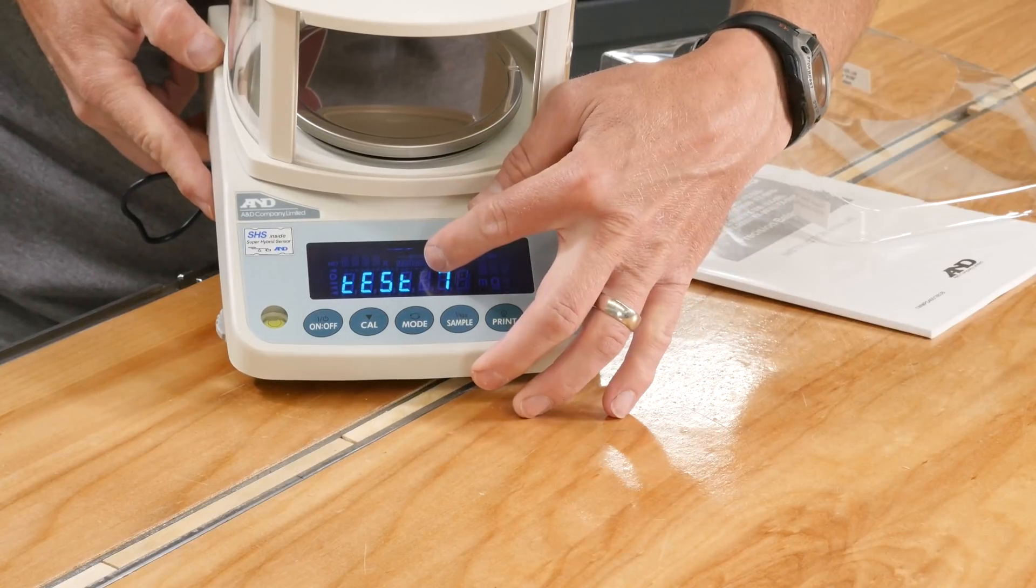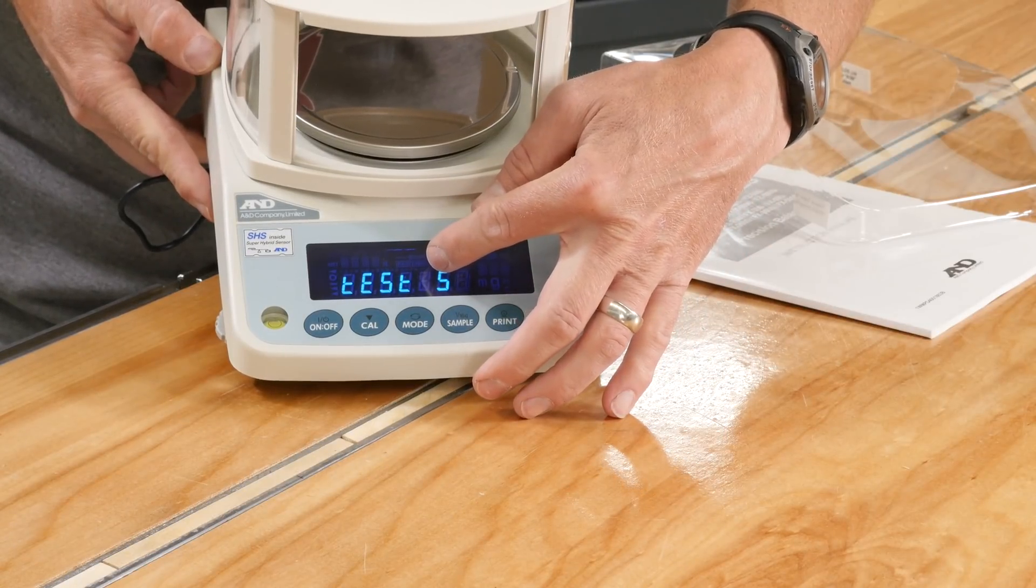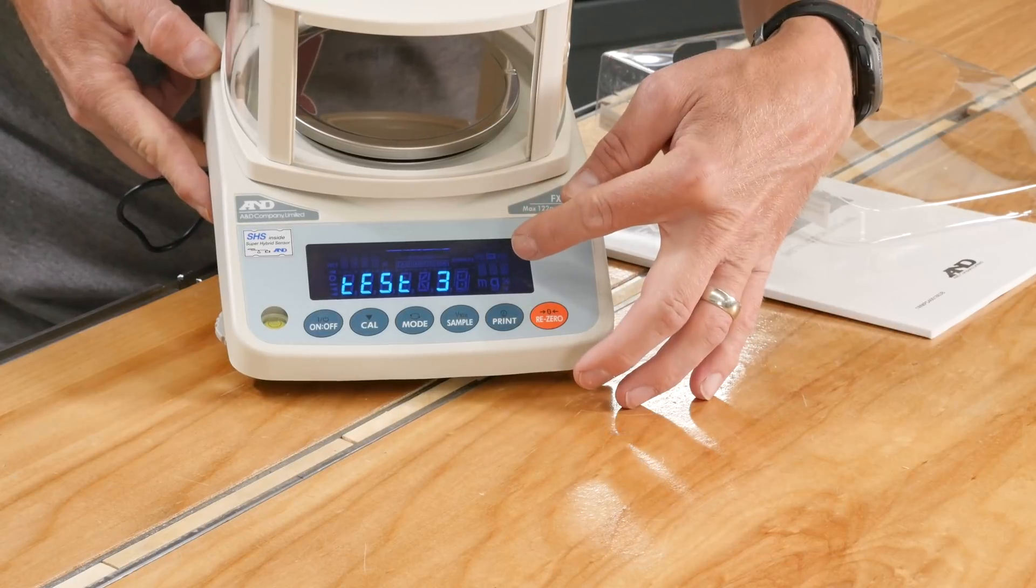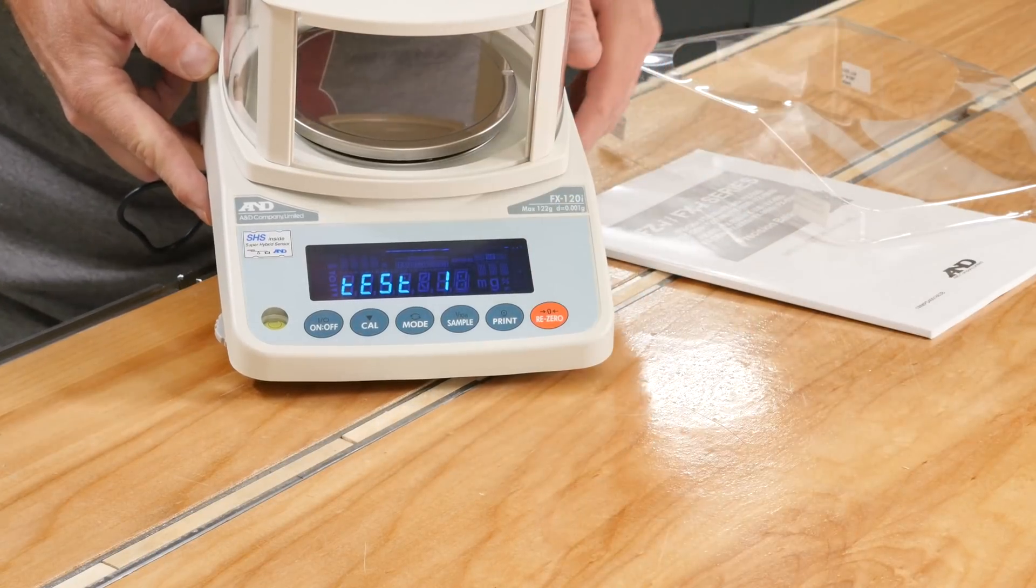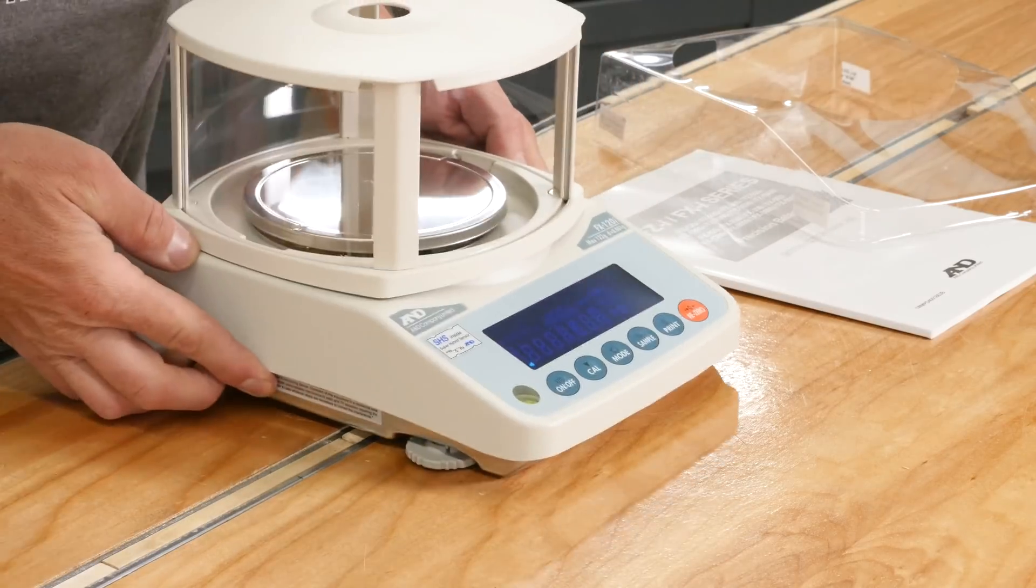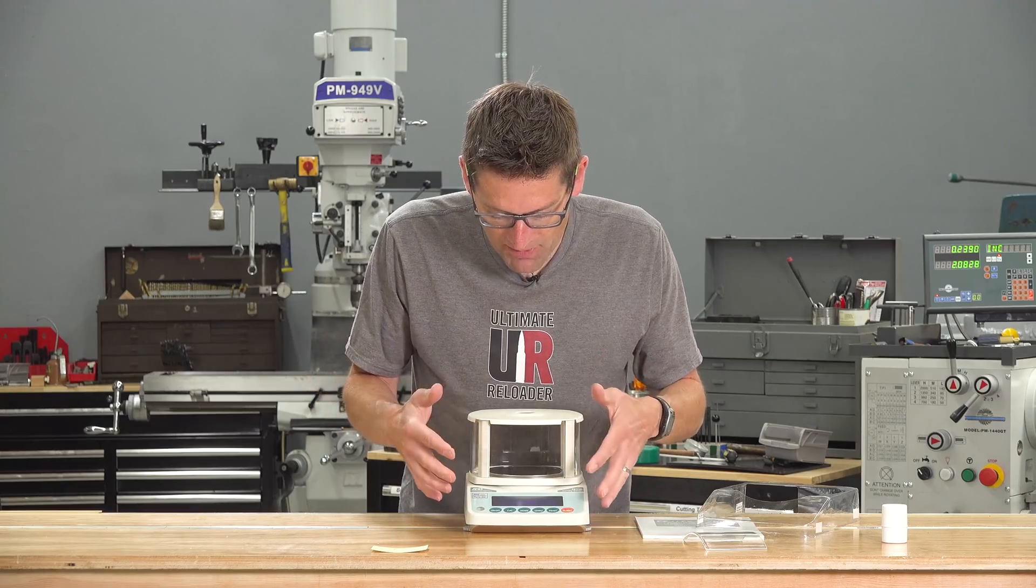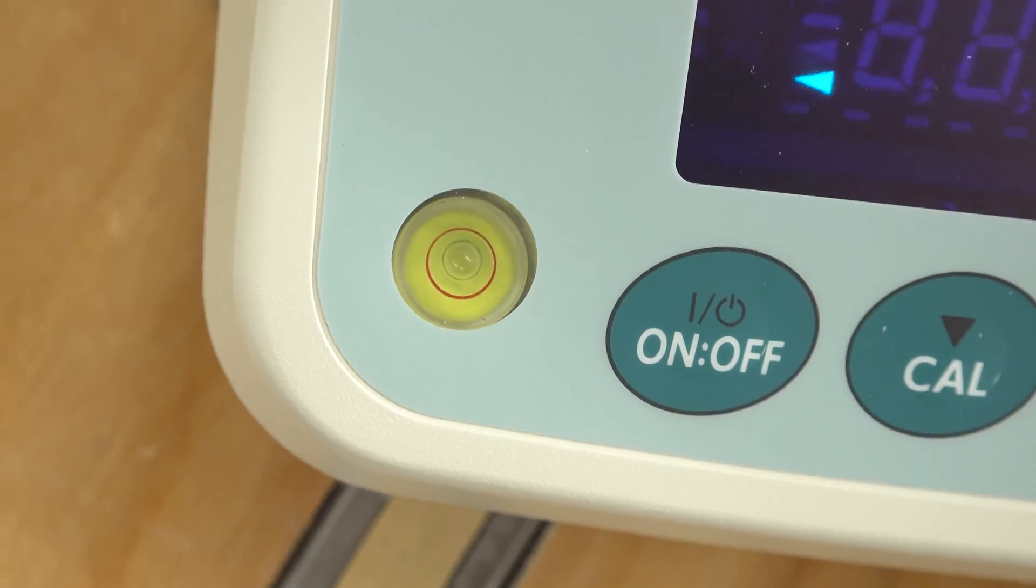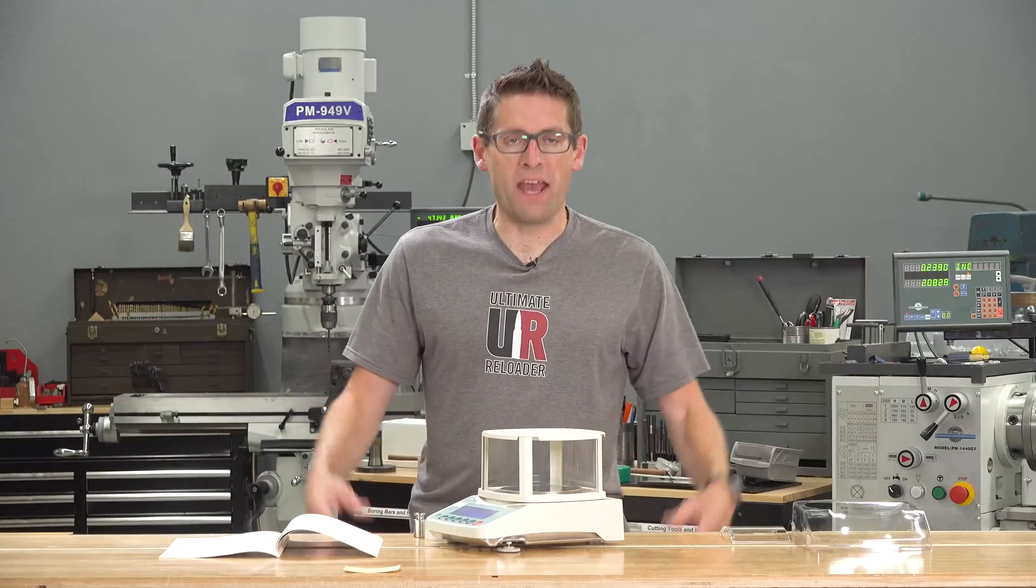This is not an LCD display. This is a special fluorescent display, which is extremely high contrast, as you can see. And what we're going to need to do before we set up and calibrate the scale is get it perfectly level. And there is an integrated bubble level.